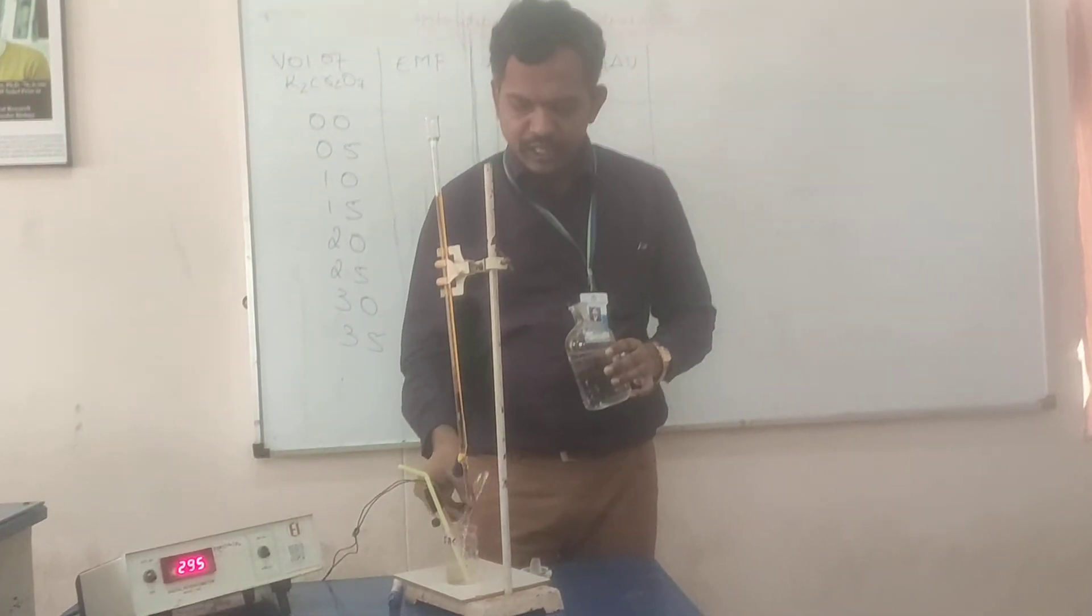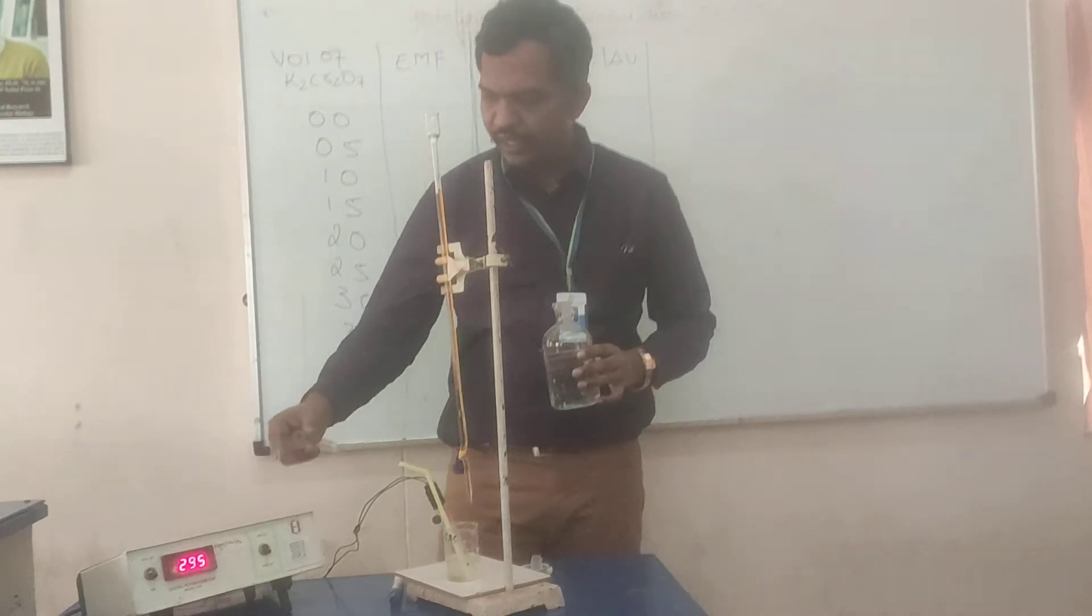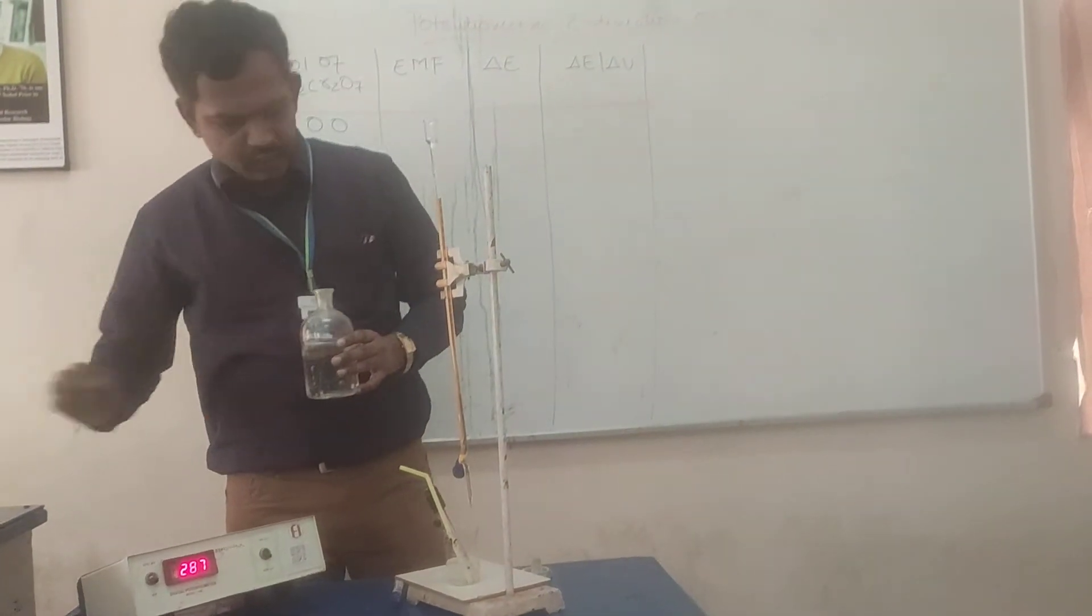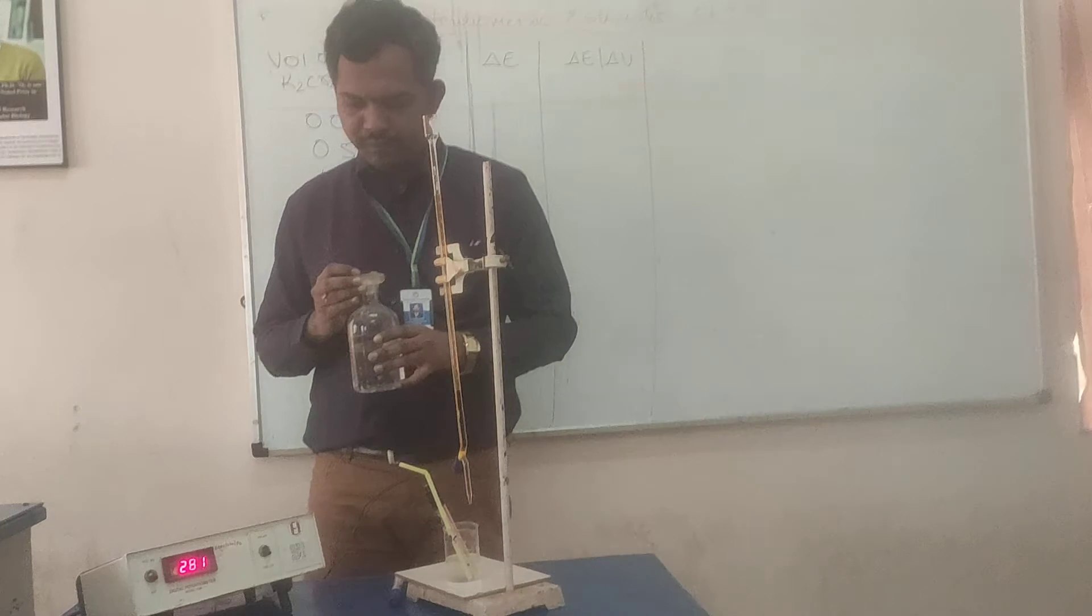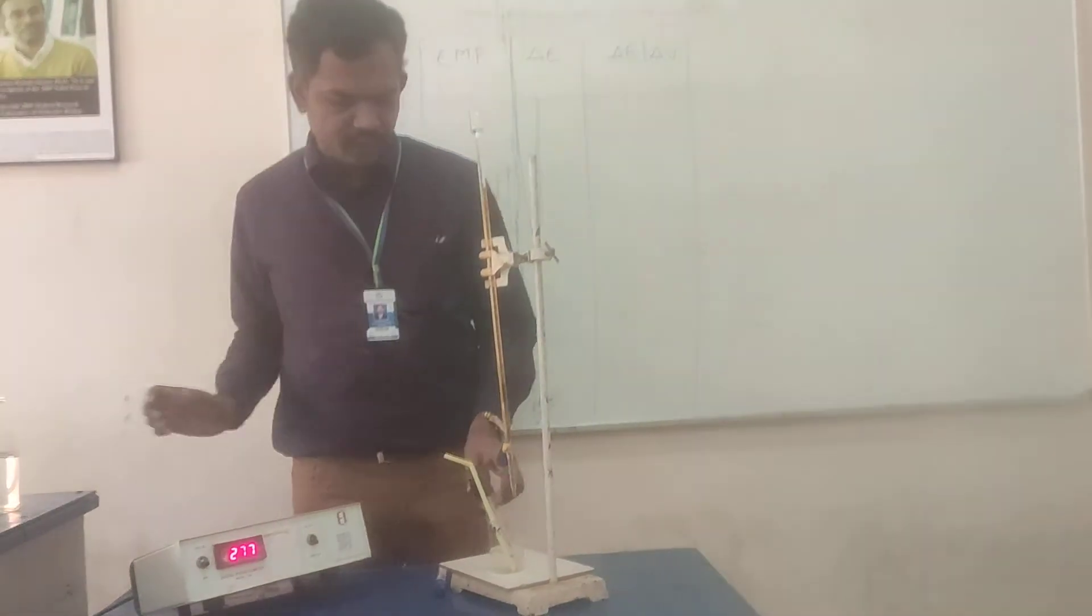So, these both electrodes are connected to the potentiometer shown here. So, once it is connected to the potentiometer, we will take the zero reading.